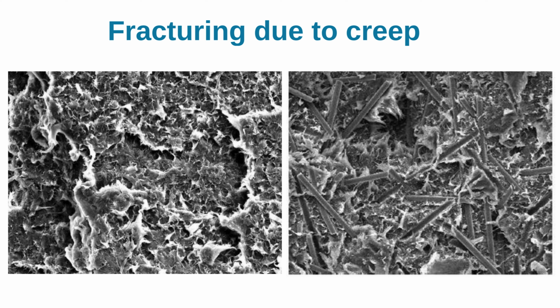Creep ruptures. Deformation occurs over time under constant load stress, leading to fractures, especially at high temperatures. Fine stretching is observed in the resin. Fracture shape. Tiers of resin are observed at the surface of the fracture appearance. Cause. The fracture occurs after enduring consistent external force.